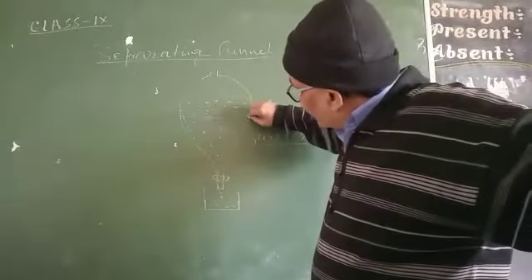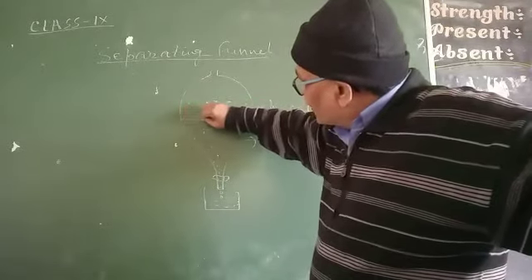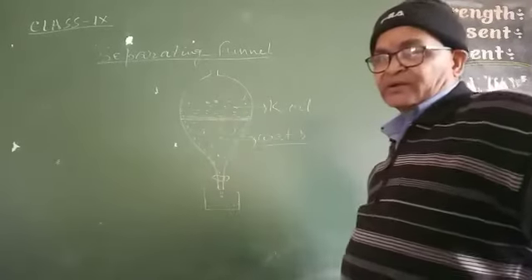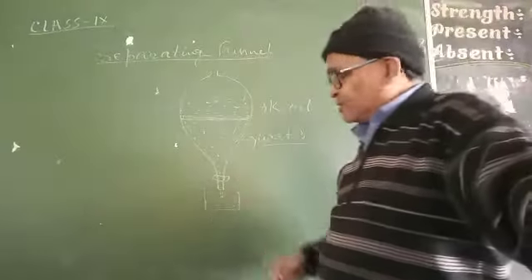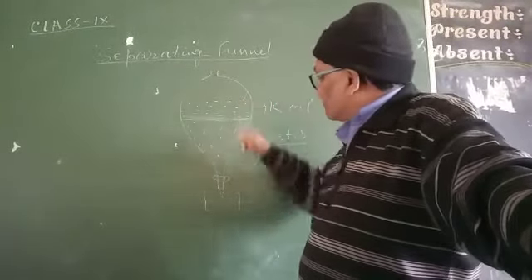Here, there is a clear separating layer between the kerosene oil and water. As you see, there is a stopper at the bottom of the narrow end of the separating funnel.